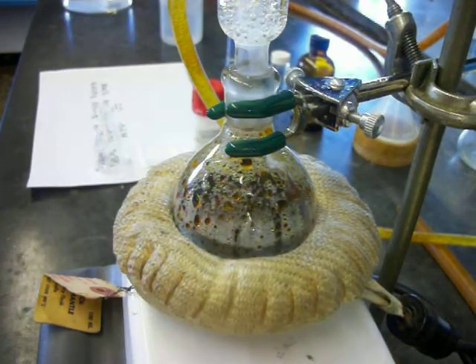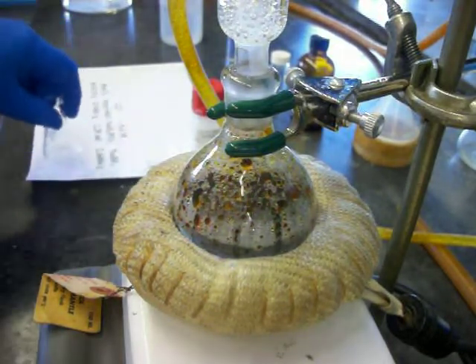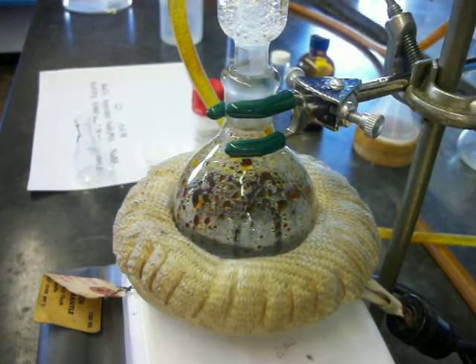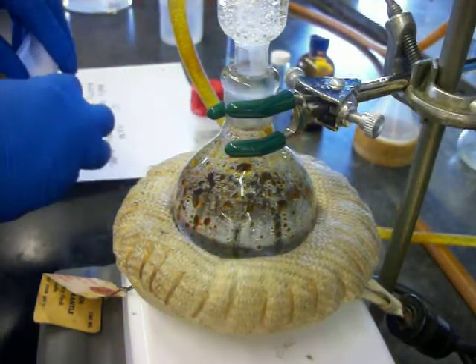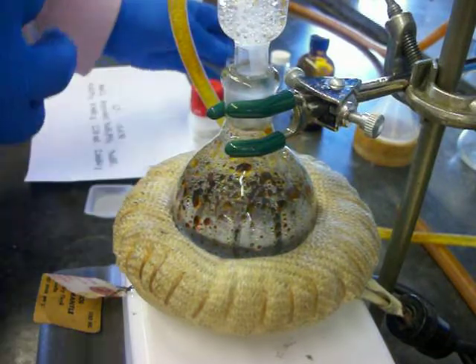We can see now that the solution has gotten very red. This has been refluxing for 30 minutes. Our next step is going to be to add the sodium tetrafluoroborate, so I'll take that and dissolve it in water and then add the solution through the top of the reflux condenser.